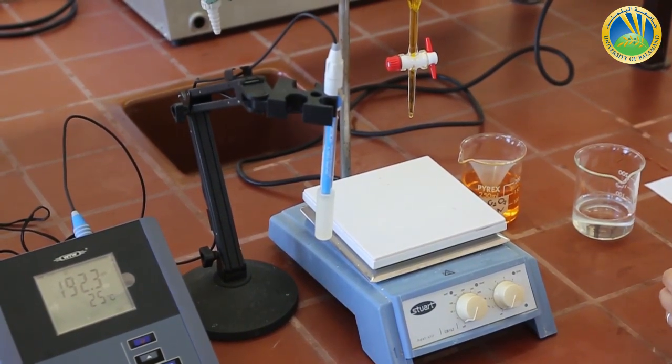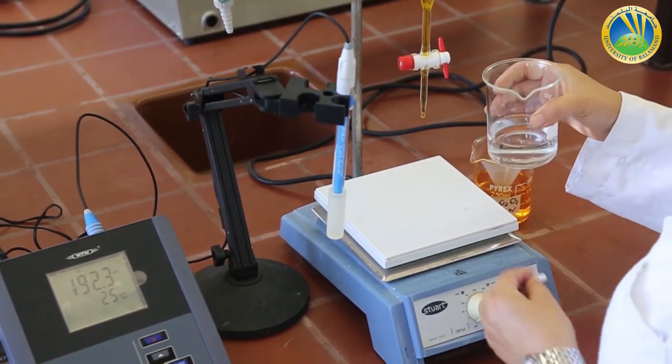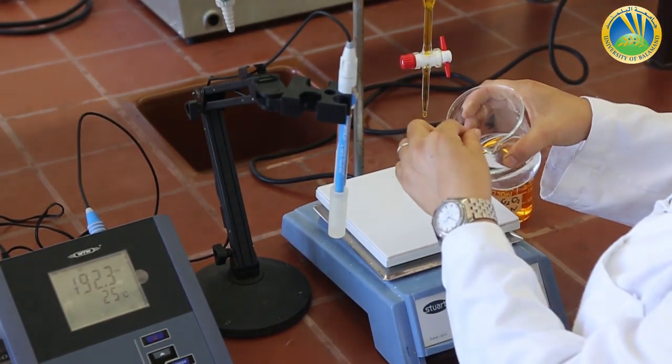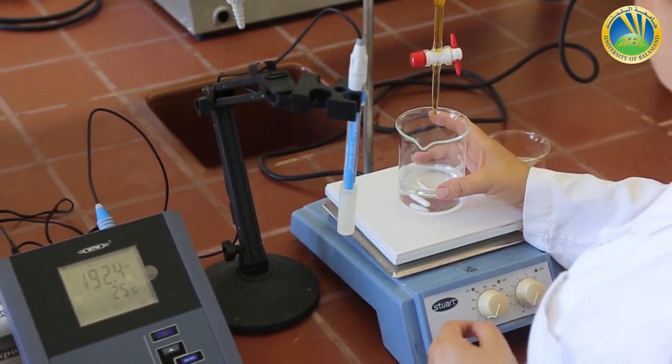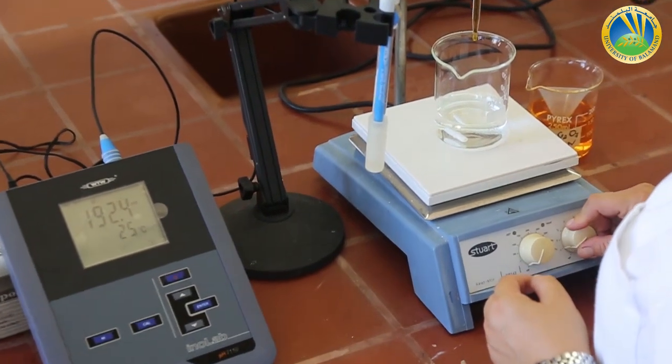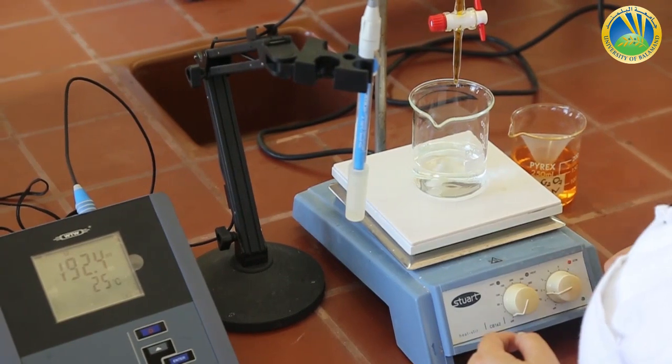We fill the burette till the mark, or a little bit above the mark to adjust it later on. We remove the funnel, adjust the mark, and take care that the lower part of the burette is filled with solution. I remove the waste beaker, put it aside, and now place the beaker with the unknown weight of ferrous sulfate. I tilt it, insert a small magnetic stir bar, and put the beaker at the center of the stirrer. I turn the stirrer on to dissolve the granules.